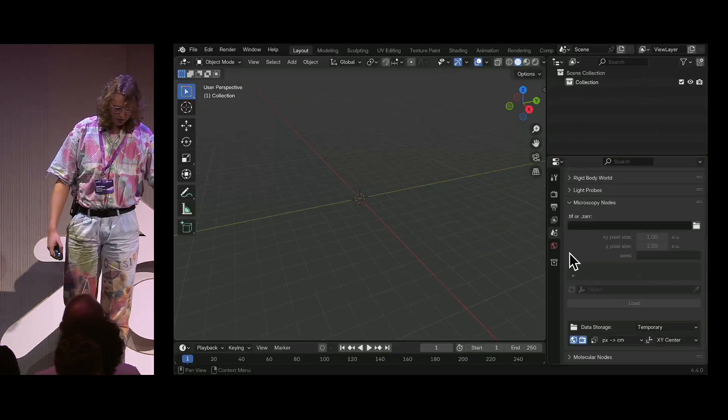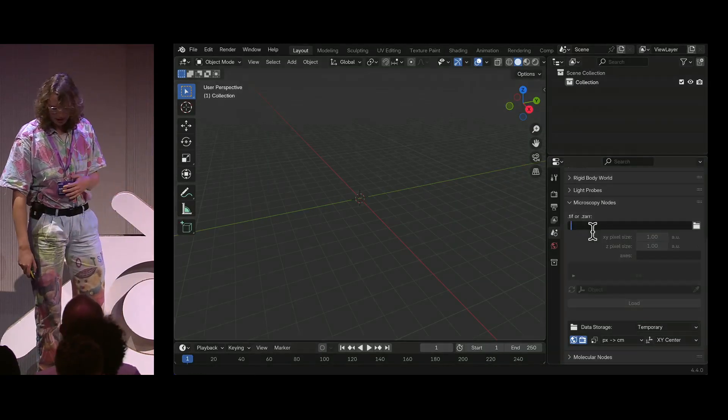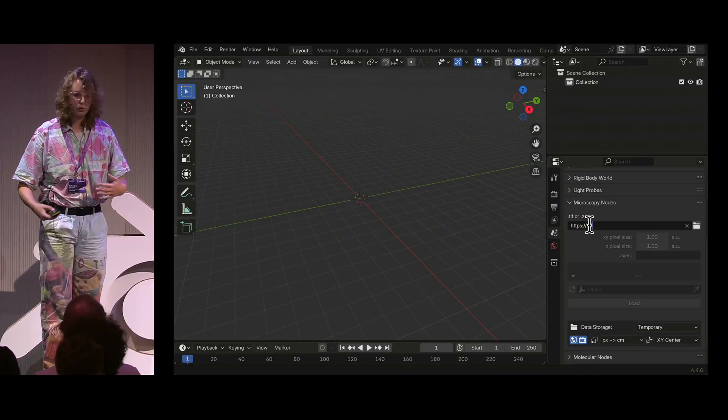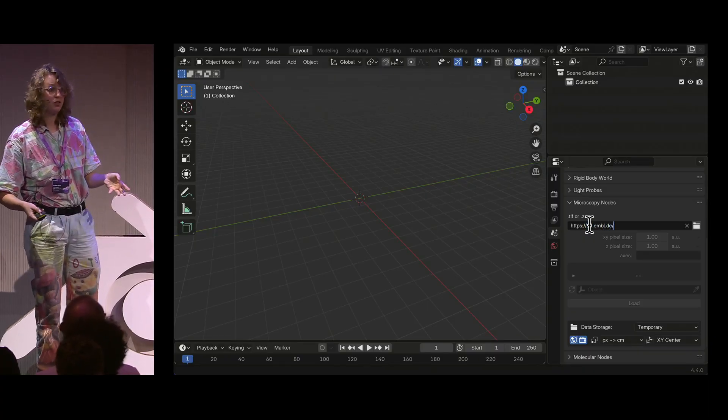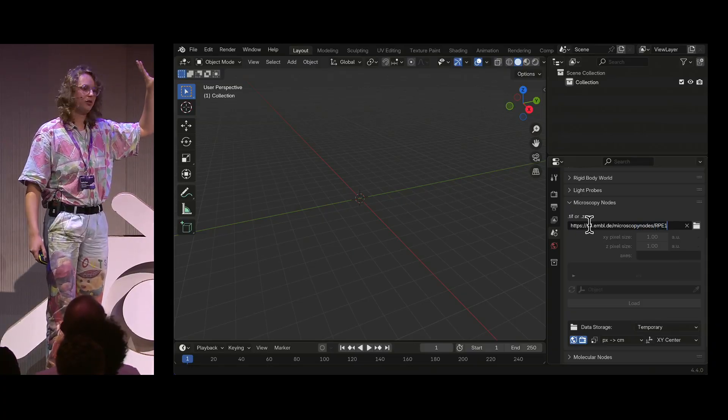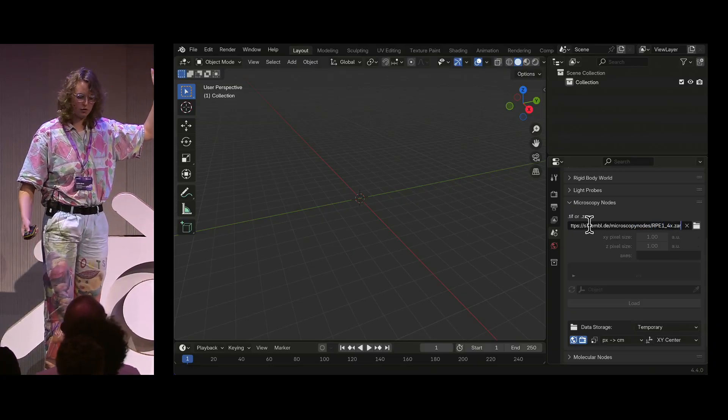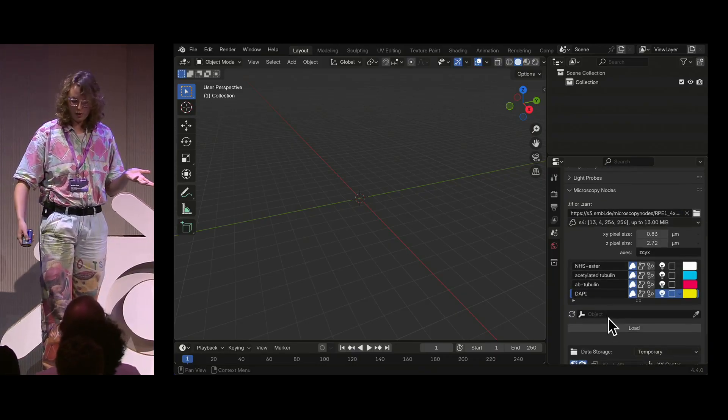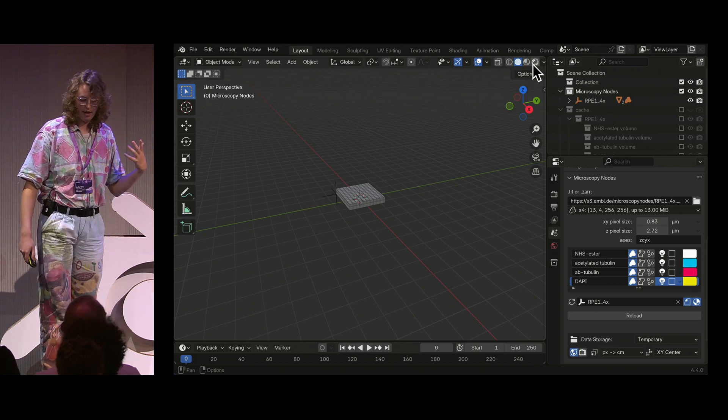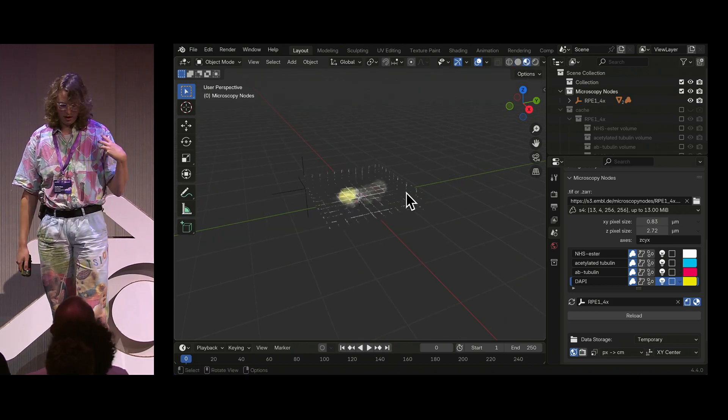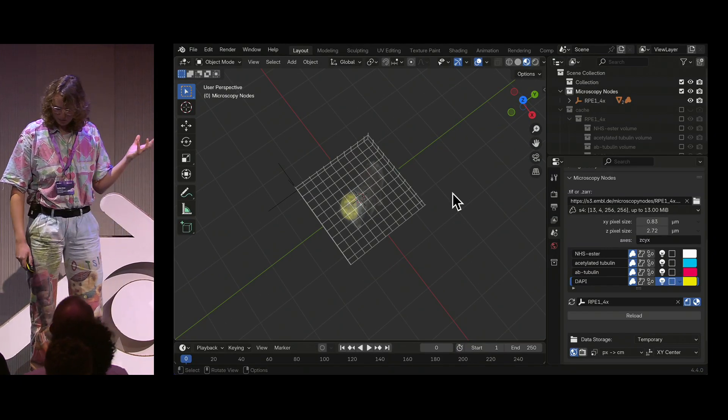So how this looks is here we're in Blender, and we can put in a URL of an open dataset. So this is one of my tutorial datasets, so you can actually follow along with this dataset at home. And just once you install it from the microscopy nodes from the Blender extension platform, you can get it. And then here right now we'll just load it immediately, and we'll get a little blob of data. And this is a human cell that was imaged by a friend of mine.